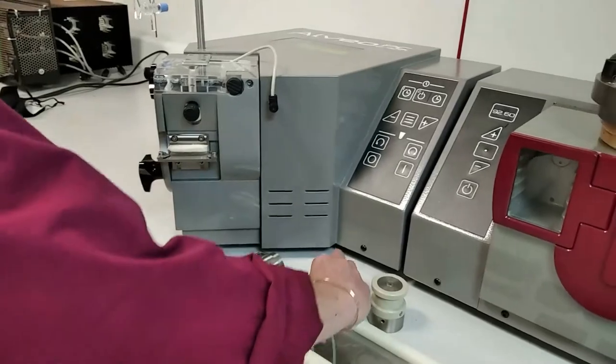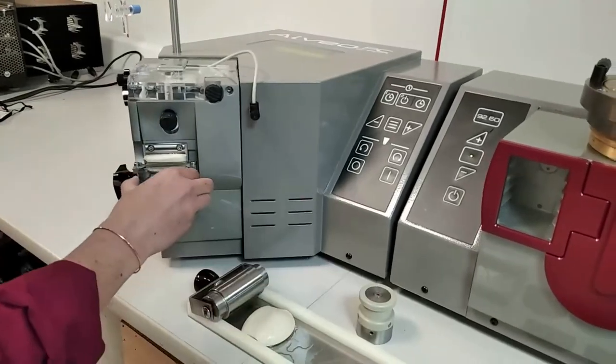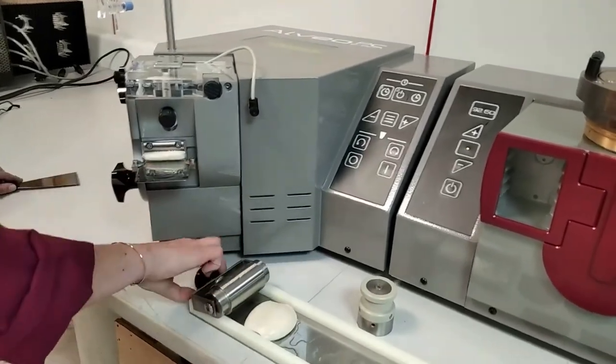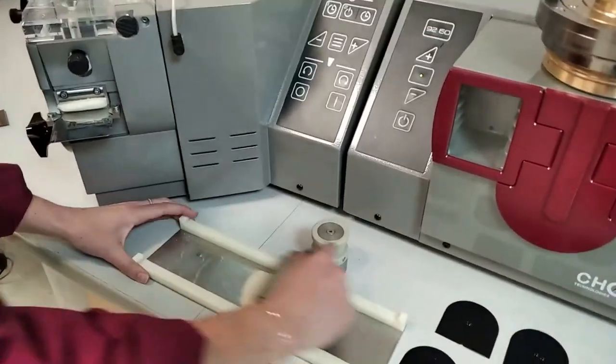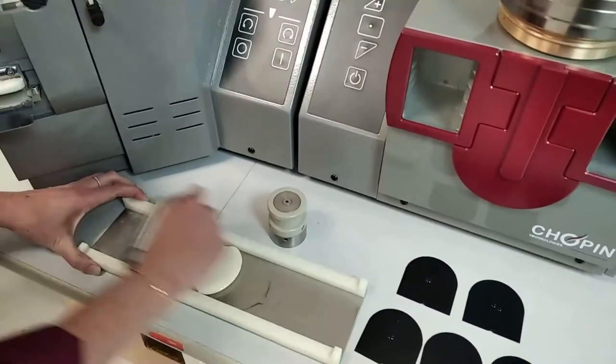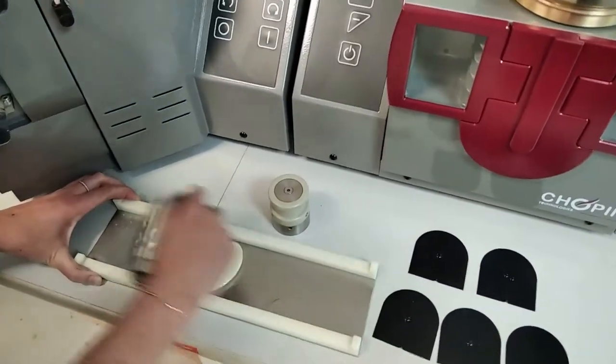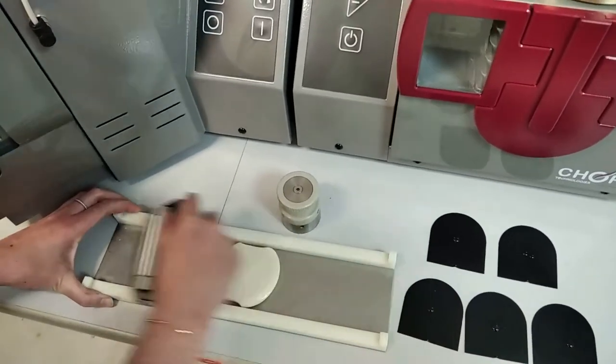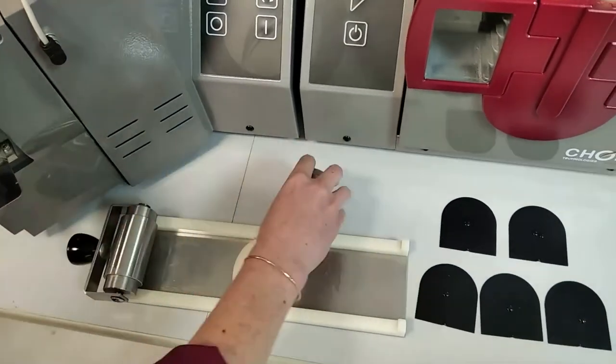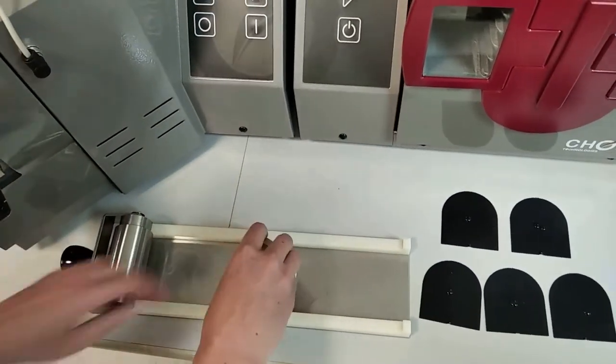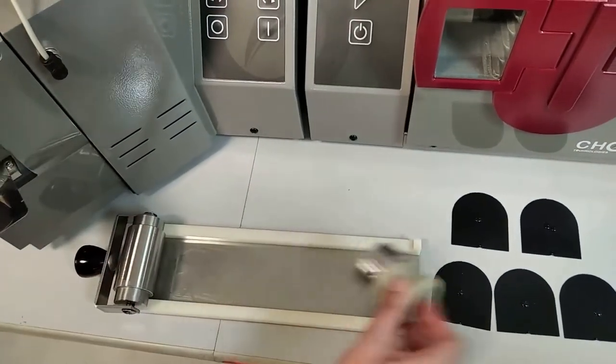Sheet the dough pieces using the roller 12 times. Using the cutter cut a test piece and remove any surplus dough. Place the obtained patty on a resting plate.